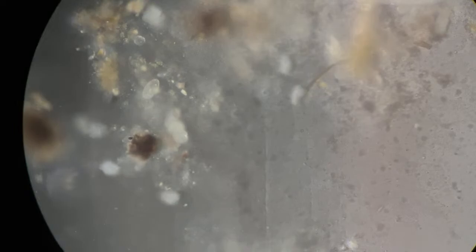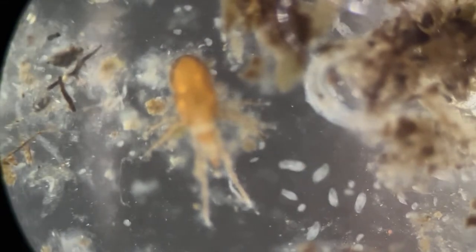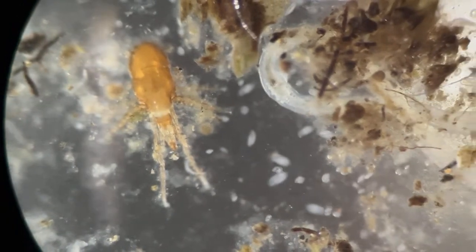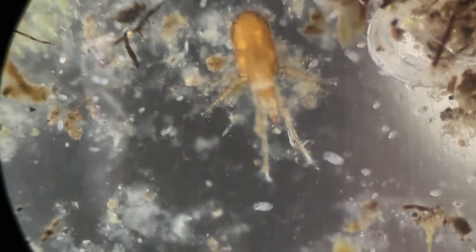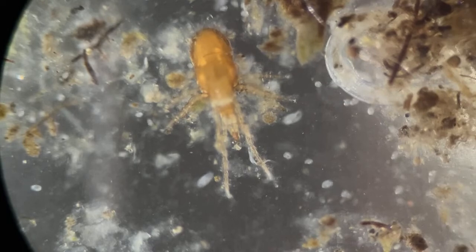So we move over to the lower magnification and just go back to the tick. There is one small pinworm on the left antenna clinging over it.